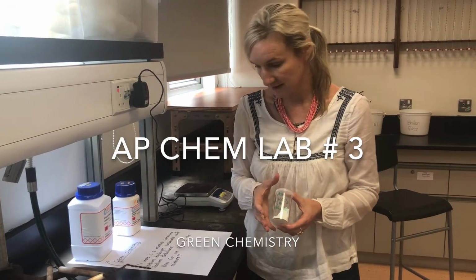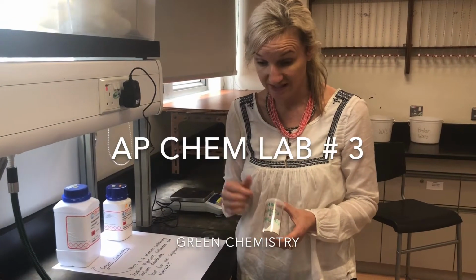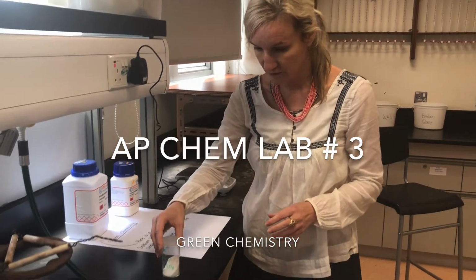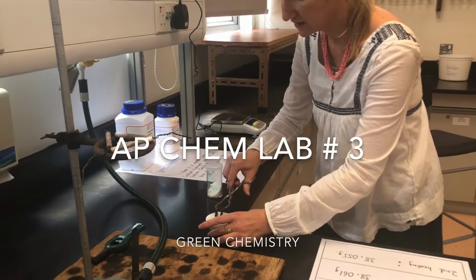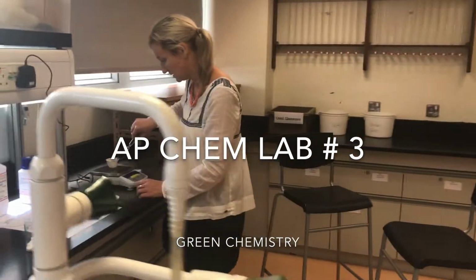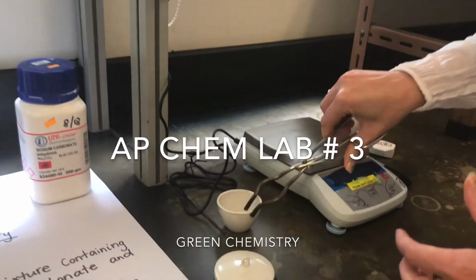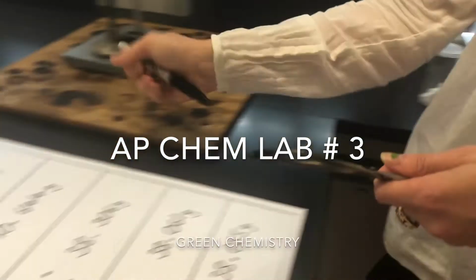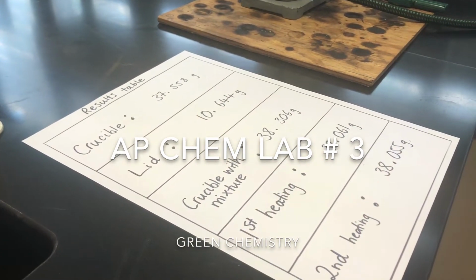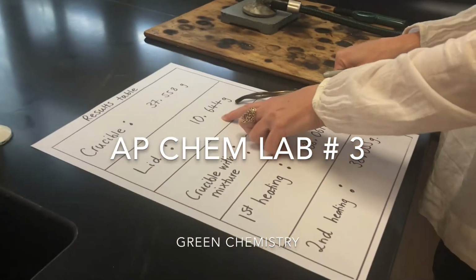We're going to use some basic stoichiometric principles to problem solve this. Usually this is an inquiry lab, but I'm going to step you through it today. What we're going to do first, and this of course is just a demonstration, is weigh my crucible on the balance and take a reading. Then I would write it down, so you can see that I've already done this. My crucible was 37.558. I would weigh my lid on the balance and write that down.